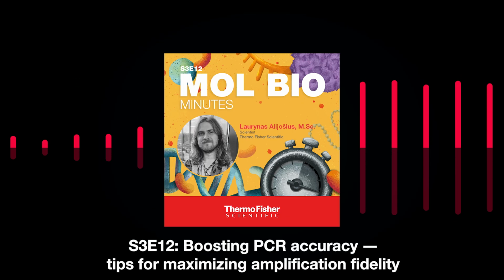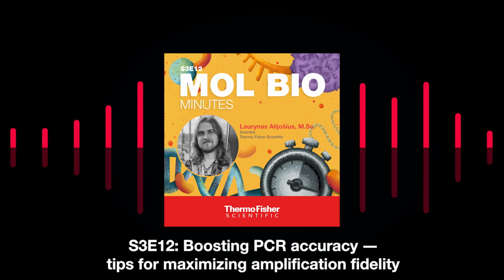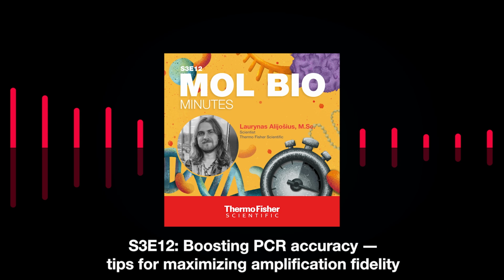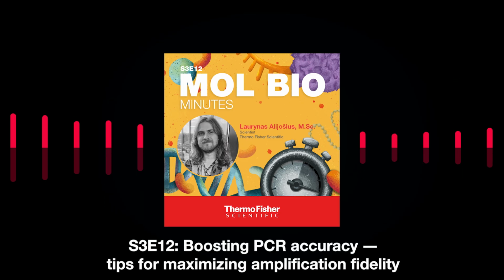Also, if you use a polymerase with a hot start feature, you can ensure that your PCR will start only under controlled conditions. And that would decrease the chance that some non-specific amplification would happen in your PCR, at least in the beginning of the PCR reaction. If all this sounds intriguing and interesting, you can use the link in the notes of this episode and learn more about how these polymerases work and learn more about this fidelity in general.